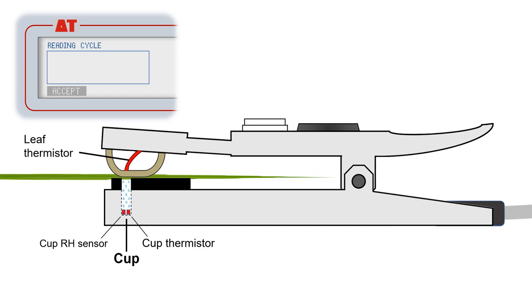Once the head is clipped onto a leaf, the AP4 measures the rate at which humidity increases inside the cup and compares it to rates obtained from the calibration reference plate. This enables the AP4 to calculate and display the stomatal conductance measurement.